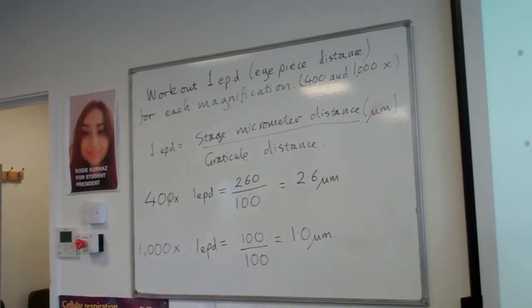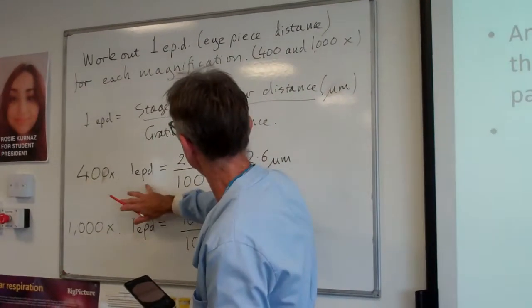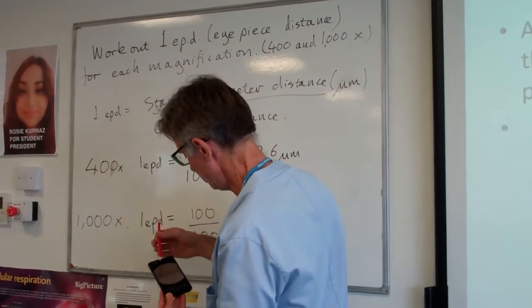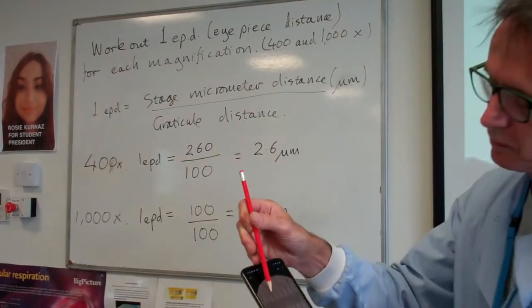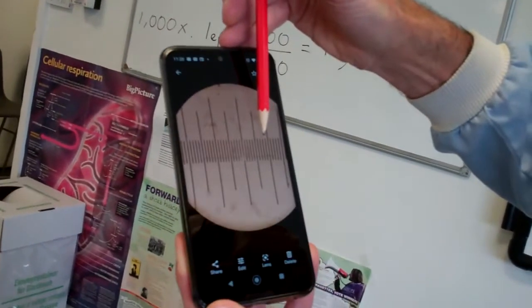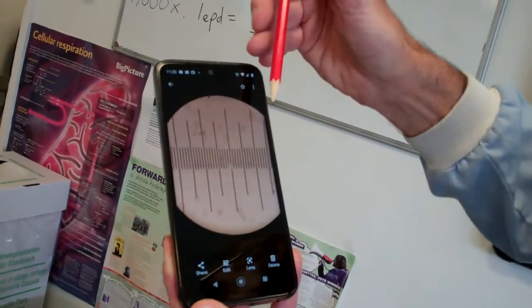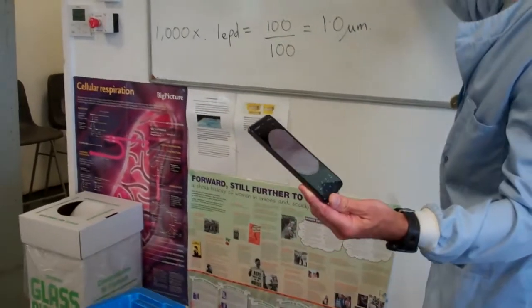If you go over to the board, I'll show you what I've got. What I want to know is how much each of these little eyepiece divisions equals. I've got 26 stage micrometer divisions from 0 to 10, which is 260 micrometers.